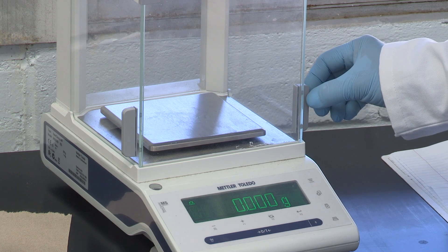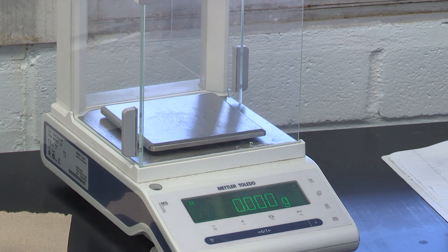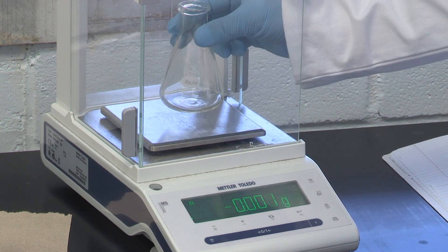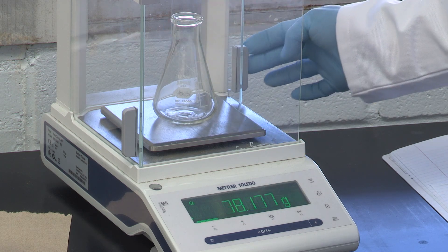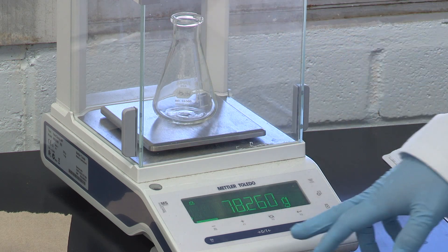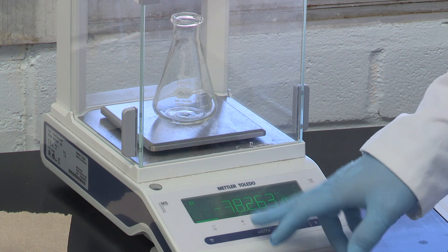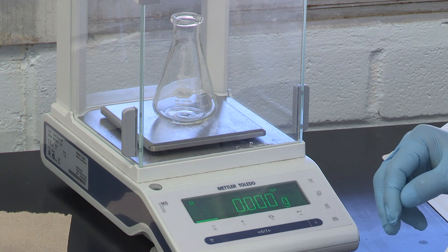Let's open the side door of the electronic balance. We place the Erlenmeyer flask on top of that and then close the door. Make sure we press the button in the center and make sure the reading is about zero.